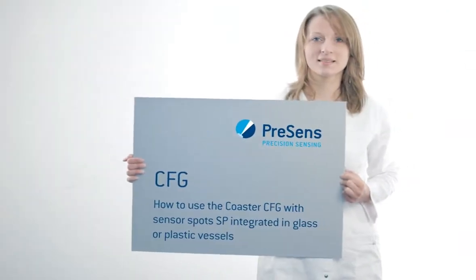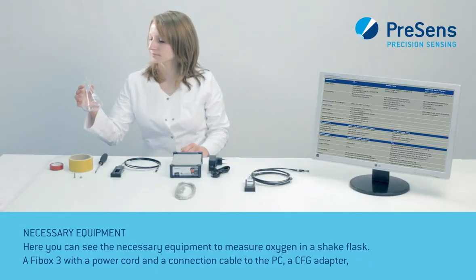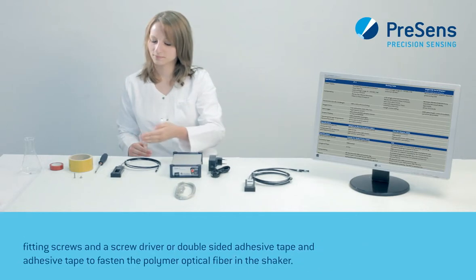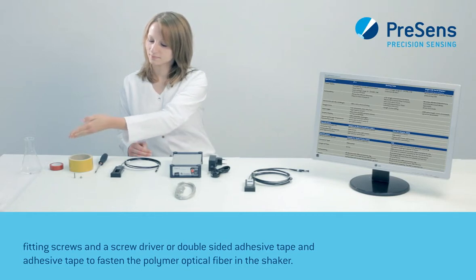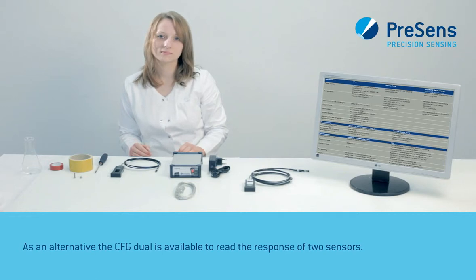Now we will show you how to use the Coaster CFG with SensorSpots SP integrated in glass or plastic vessels. Here you can see the necessary equipment to measure oxygen in a shake flask: a Fibox 3 with a power cord and a connection cable to the PC, a CFG adapter, fitting screws and a screwdriver or double-sided adhesive tape, and adhesive tape to fasten the polymer optical fiber in the shaker. As an alternative, the CFG Dual is available to read the response of two sensors.